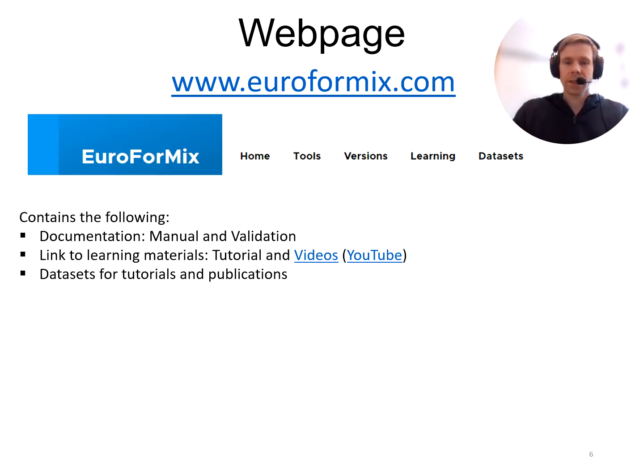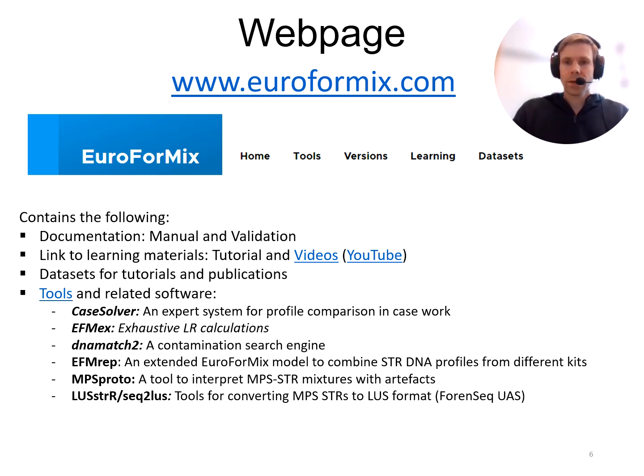So on the web page, you can get the manual and validation documents. And also there are links to tutorial videos which are put online on YouTube. In addition, there are datasets available used for either tutorials or publications. It is also possible to find versions of different related software. I will not go into these in this presentation.